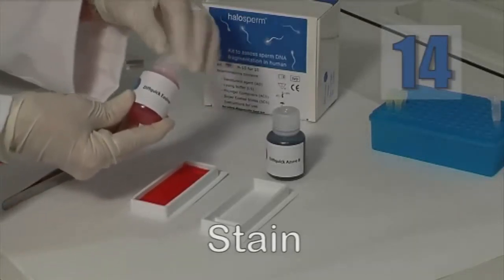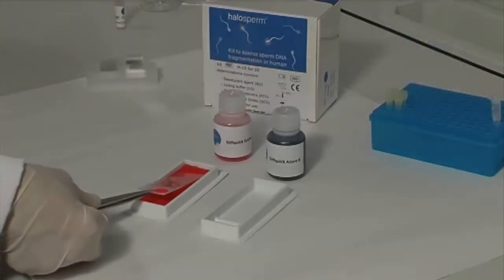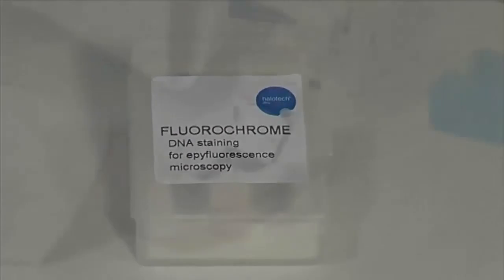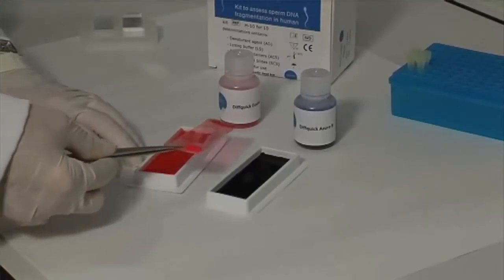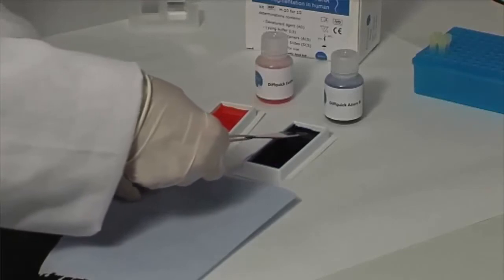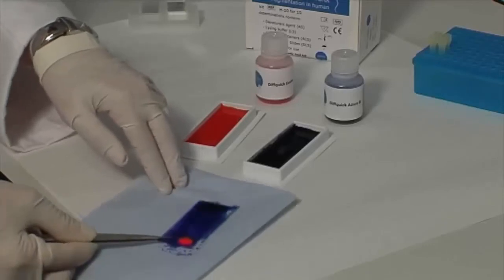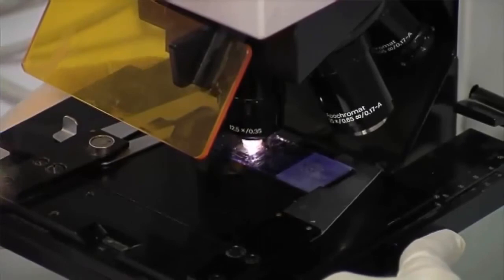The last step is to stain the slide. Use DiffQuick for visualization under a bright field microscope or any DNA-specific fluorochrome for visualization under fluorescence microscopy. For bright field microscopy, incubate the slide in eosin for 6 minutes and then a further 6 minutes in Azure B. Leave to dry at room temperature without washing. Once dry, the slide can be analyzed under the microscope.